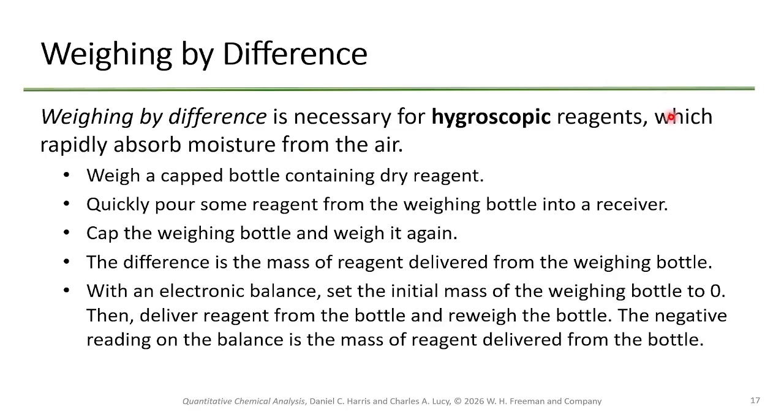Okay, what about hygroscopic reagents? Anybody know what hygroscopic reagents are? Okay. So this is where your reagent absorbs moisture from the air. Major problem in Tennessee, obviously, right? Not so much of a problem out in the Rockies. Huge problem here. Okay? Really, most things are some degree of hygroscopic.